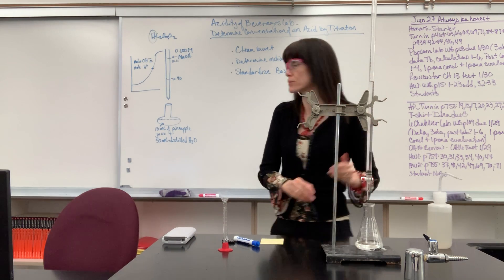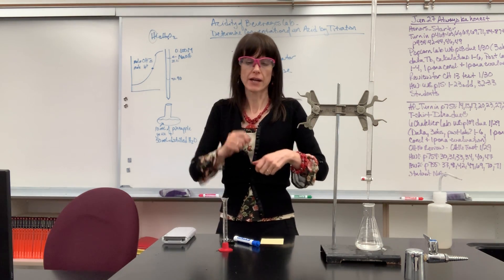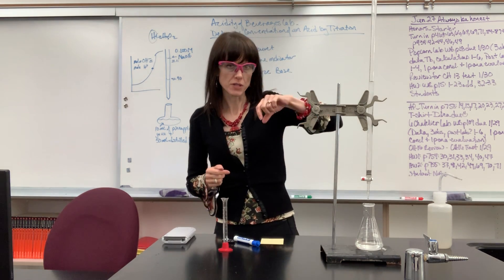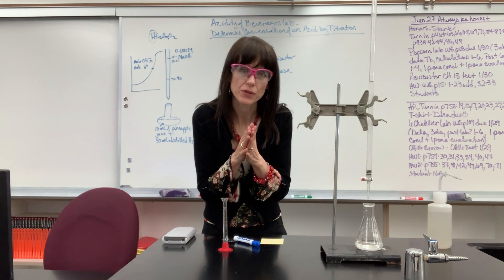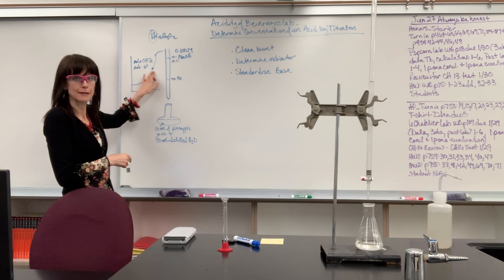So, let's say I go drop, drop, drop, drop, drop, drop, drop. I'll start seeing flashes of pink, so I'll stop, swirl it, add a drop, it flashes pink, stop, swirl it. So, when you add a drop, turns pink, swirl it, and it stays pink for 30 seconds, it means that you've reached the equivalence point right there.